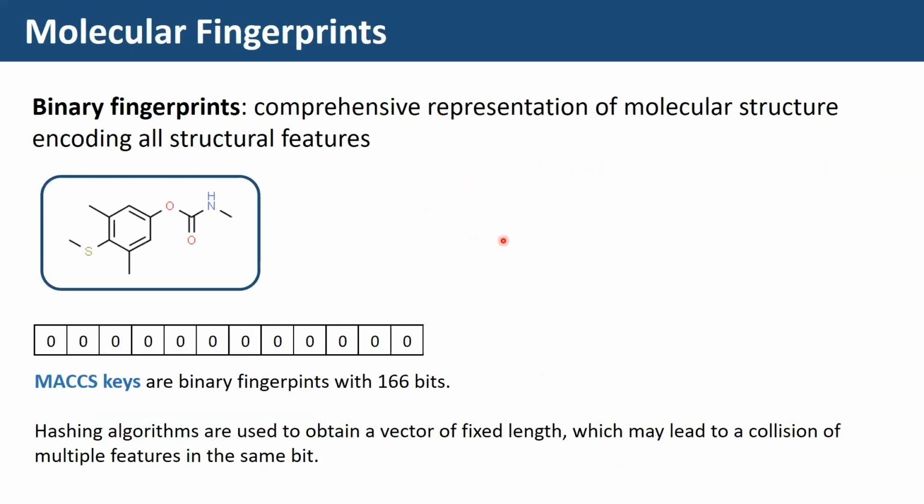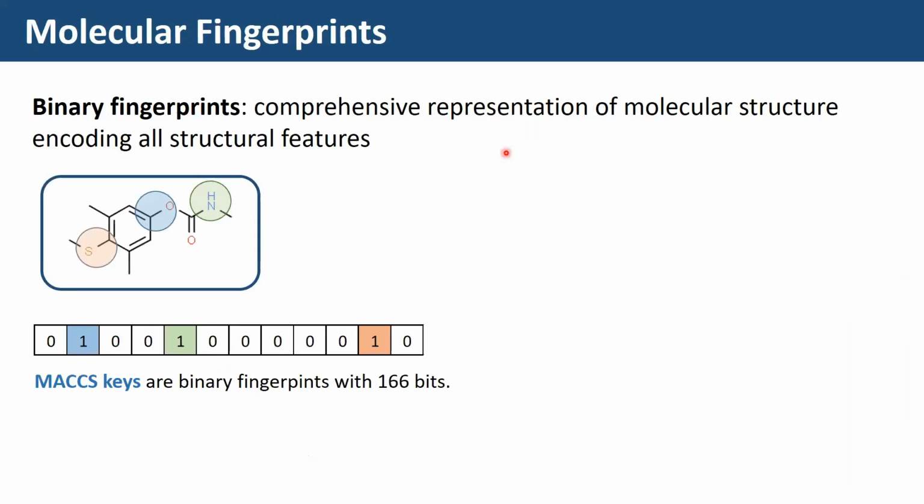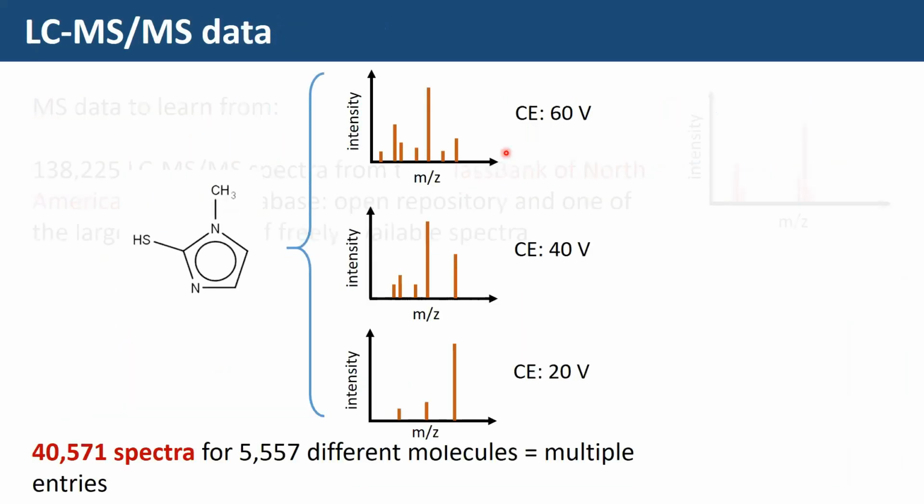Here we are using 6,500 features, and if you just add one, I think we tried it, but it does not give you much information. It does not improve the results. Maybe you could split the data on the basis of the collision energy, but then you have reduced the data sets. Okay. Yeah, I like the idea though. Maybe you should use it as a dummy variable instead of just having the voltage, and then block scale it.